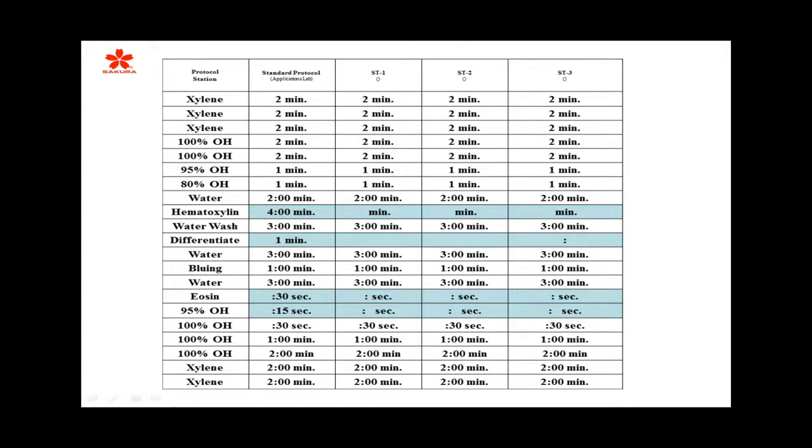The key thing is to set up some kind of system like we have here, where you can optimize, or progressively optimize the stain to your pathologist's preference, and then you lock that in to whatever the preference is. Now, I can email this chart, or you can probably get it from Sakura, just to use as a template to make your own. And the handout is basically too small to read.